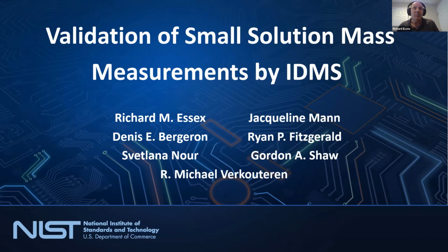In this case, I'm talking about mass measurements of dispensed aqueous solutions, 1 to 5 milligrams, which it turns out are very difficult to measure because the solution is essentially evaporating while you're trying to get its mass. So even with very sensitive 6-place balances or ultra micro balances, you're essentially watching your sample disappear while you're trying to get the mass of it. This talk is going to be about using mass spectrometry for maybe getting around that problem.